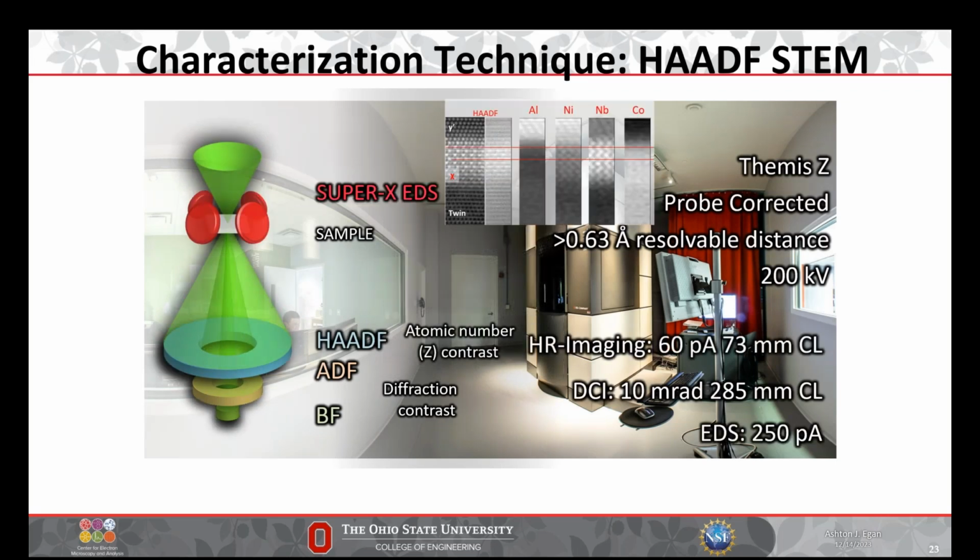There's a couple of factors at play here. You can see in this little schematic, there's a sample, and it's surrounded by 4 EDS detectors. Or in this case, there's a variety of different architectures for doing EDS in TEM. If the sample is not exactly flat, so let's say I tilt it towards one detector, and I'm talking about the Super X detectors, you would then shadow the detector from the opposite side. So to maximize counts in EDS, you'd basically want no tilt at all so that you can get the most counts. You want a good signal to noise ratio, because it takes a decent amount of time, the sample drifts a little bit, and you want this to happen in some reasonable, feasible time. So that's one of the reasons.